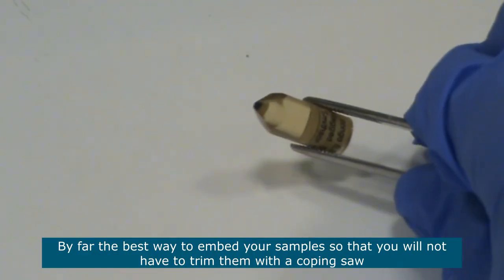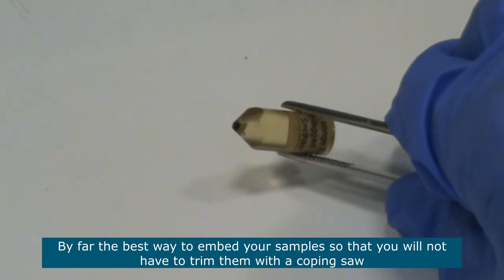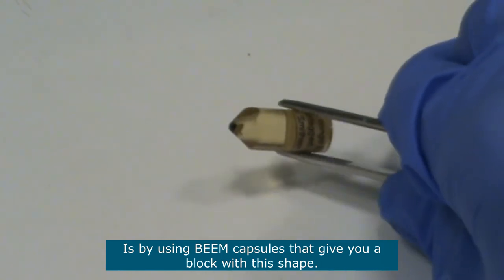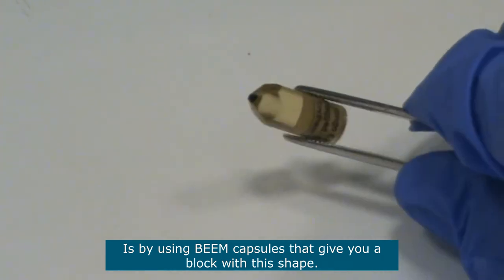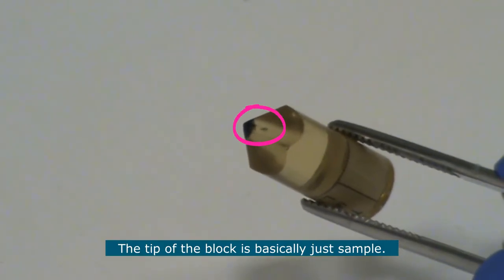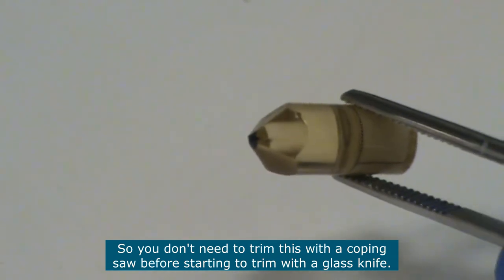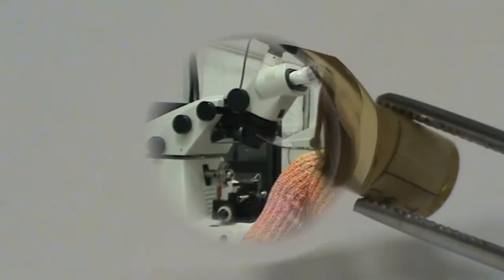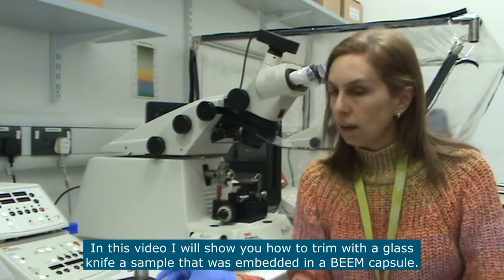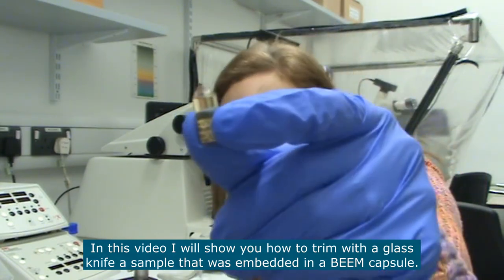By far the best way to embed your sample so that you won't need to trim it with a coping saw is by using beam capsules. Beam capsules give you a block with a tapered shape, and the tip of the block is basically just sample. So you don't need to trim with a coping saw at all before starting to trim with a glass knife or a razor blade. In this video I'm going to show you how to trim a sample that has been embedded in a beam capsule.